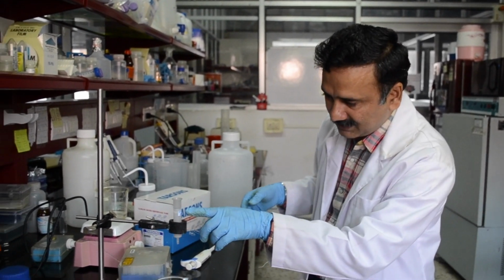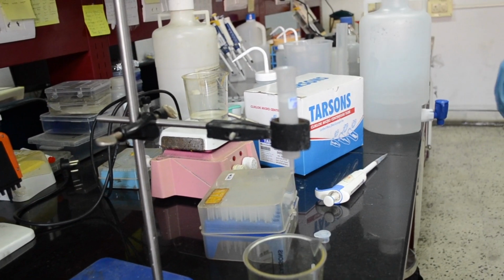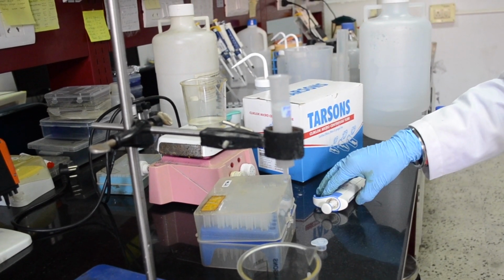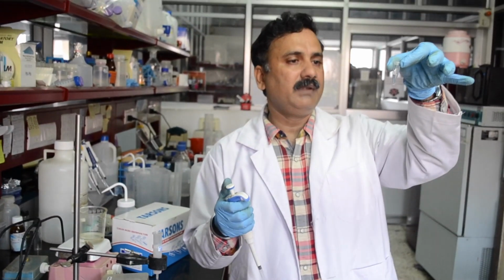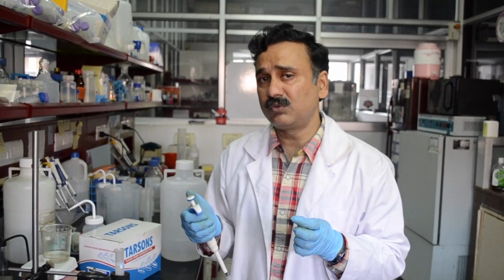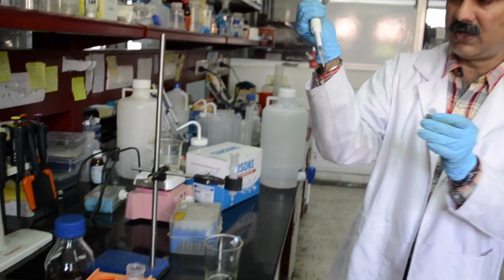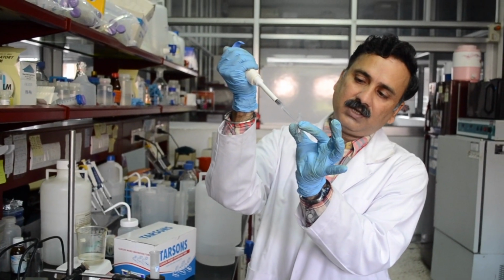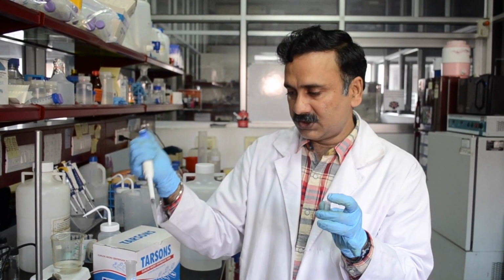So what you see is that the level is now going to the disk, and in between what you have to do is prepare the sample. In this case we have 0.5 ml of the protein. You have to bring the protein solution to 1.5 ml. So you can simply add the water or the buffer, whatever you are interested in, so that it is going to be 1.5 ml, and then you can load that.